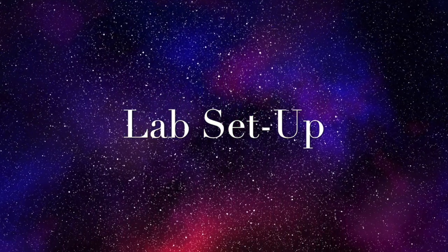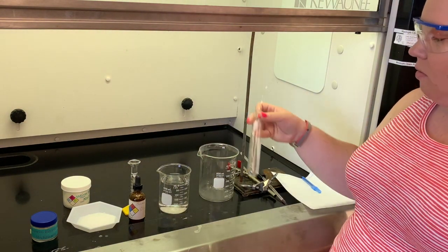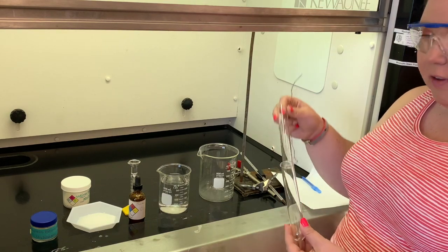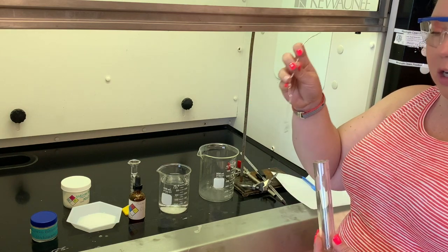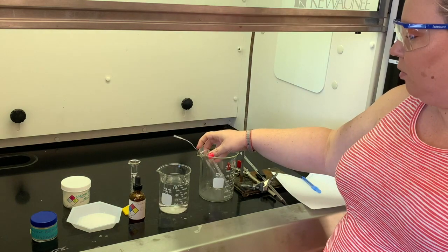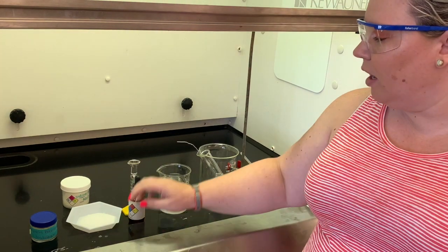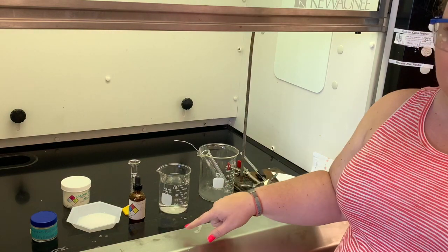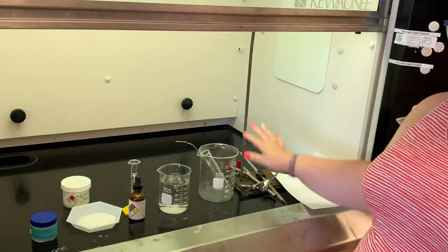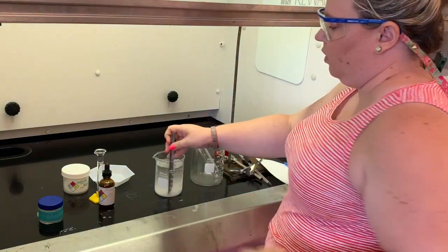Today's lab is the freezing point depression lab. Here in my hood I have everything that I need. I have a large beaker — that's where our ice bath is going to go. I also have two test tubes that are kind of fitted together; the big one is just for insulation. I'm also going to have the stirrer in there when we start freezing our sample. I have some water, and we're going to dissolve about 50 grams of salt. I also have the cyclohexane. The first thing I'm going to do is dissolve the sodium chloride, the salt, into the water, and then we'll pour that over the ice bath.